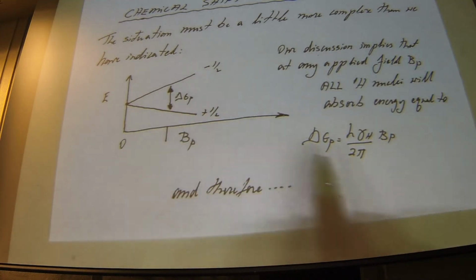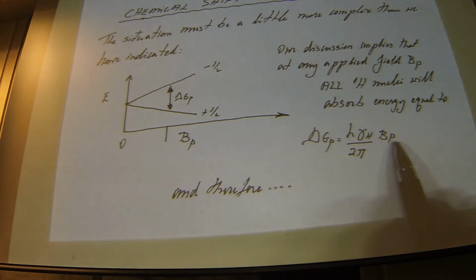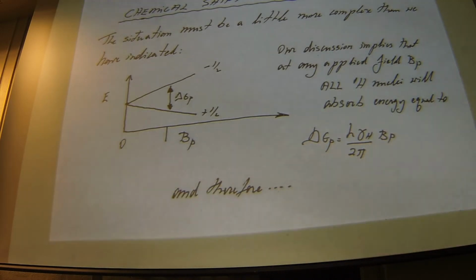And so there's got to be more to this equation, because what this implies is that for any given field strength, this is the energy separation. But remember what I said about the field. It's not the applied magnetic field. It's the field experienced by each proton, and it's not the same. So here's what you want to think about. I have a strong magnet. Sure, that gives you 70,500 Gauss. But where I measure at the proton, that 70,500 Gauss is not 70,500. It's either a little bit more or a little bit less. Why should it be different? I mean, heck, I applied that magnetic field.